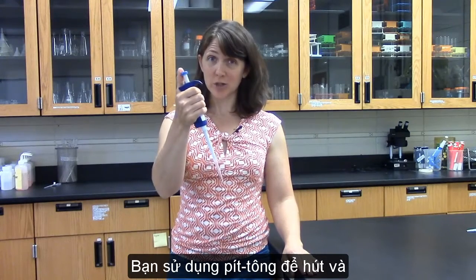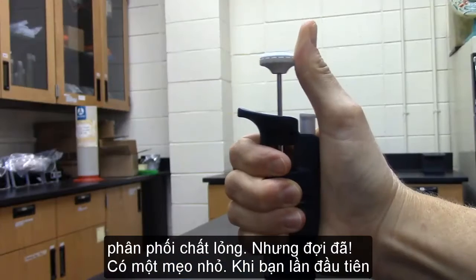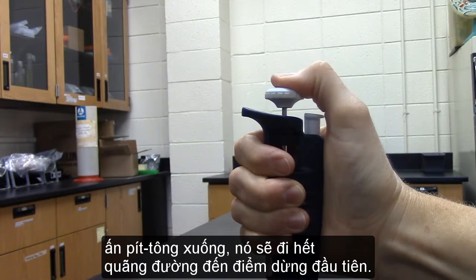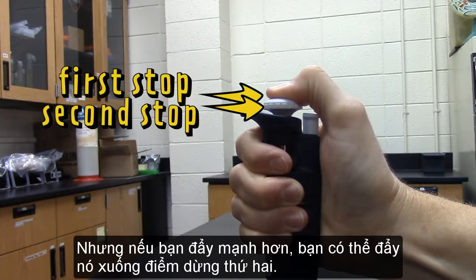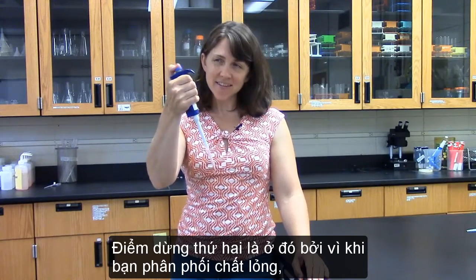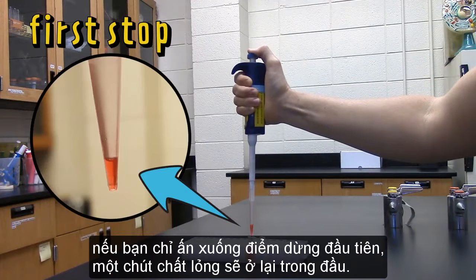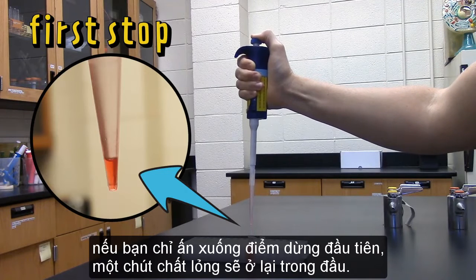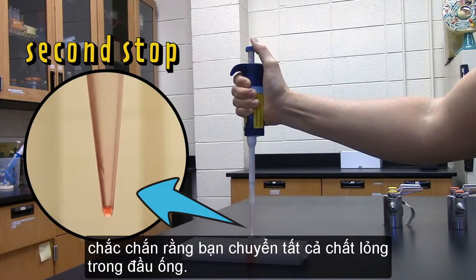You use the plunger to draw up and dispense the liquid, but wait, there's a trick to it. When you first push down the plunger, it goes all the way to the first stop. But if you push harder, you can push it down to the second stop. The second stop is there because when you dispense the liquid, if you only push down to the first stop, a tiny bit of liquid stays in the tip. Pushing down to the second stop squirts the rest of the liquid out, so you are sure that you transfer all the liquid in the tip.